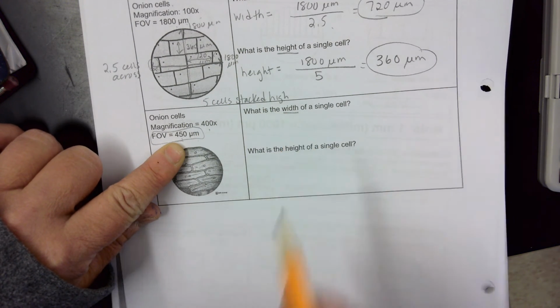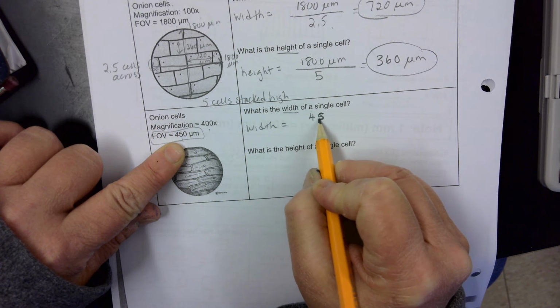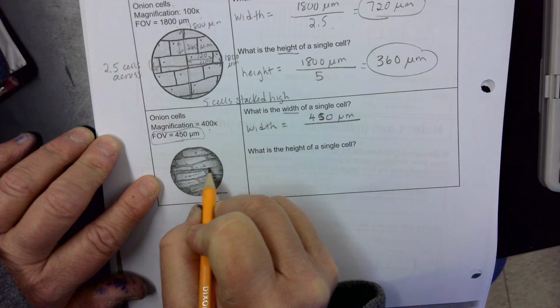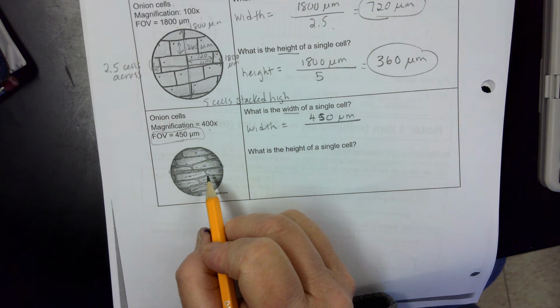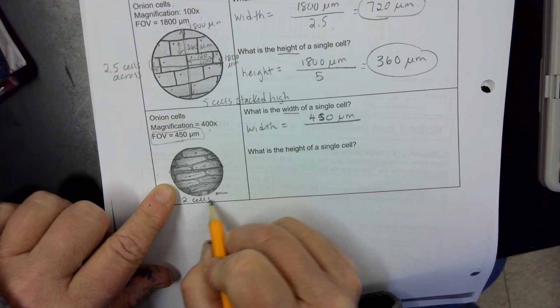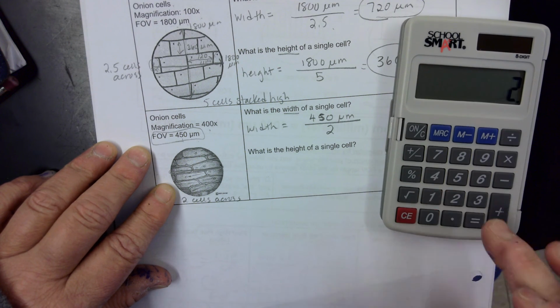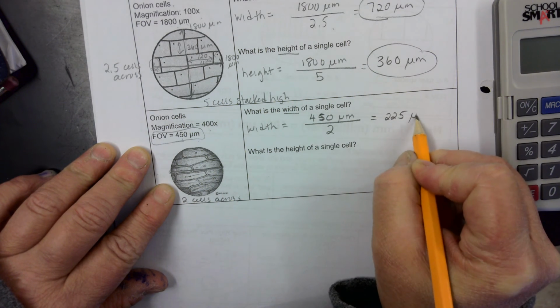If we want to find the width of a cell, we need to take that field of view, that 450 micrometers, and we're trying to find the width, so we have to count across the diameter, and I would say that we have about 2 full cells going across, perhaps 2 cells across. So 450 divided by 2 is 225. Right, so the width of this cell is 225 micrometers.